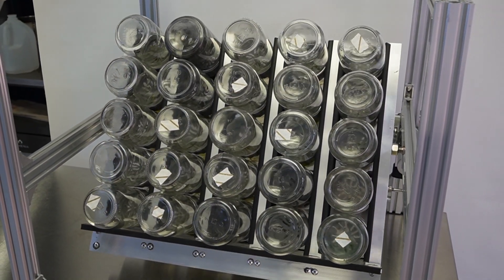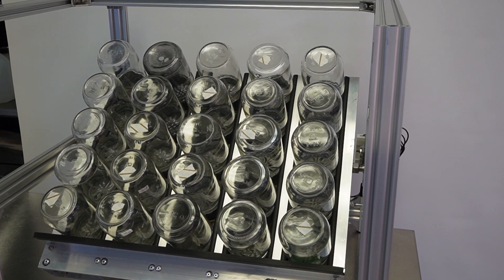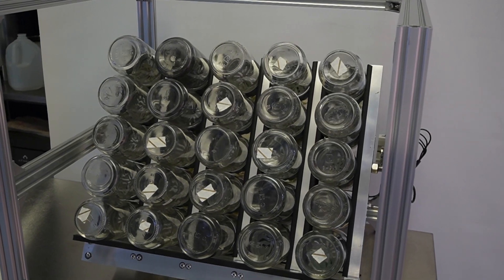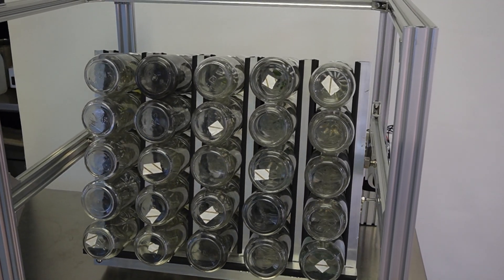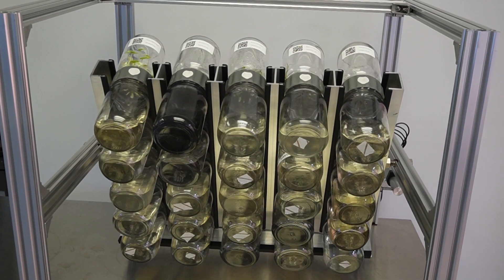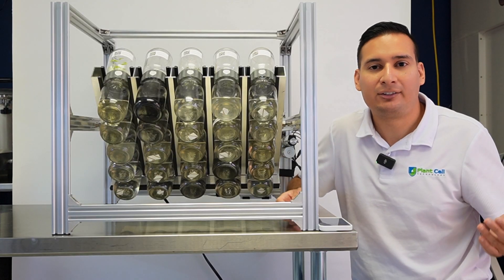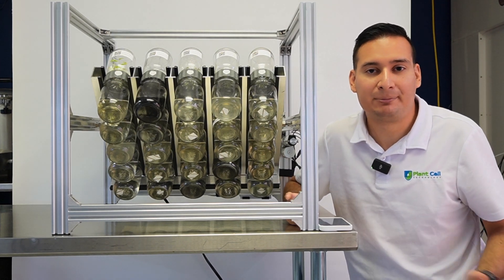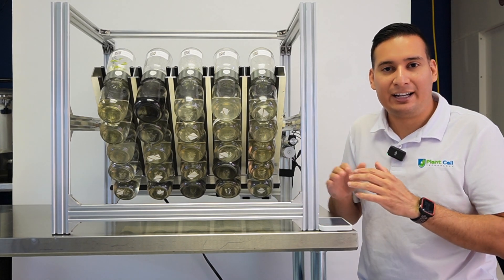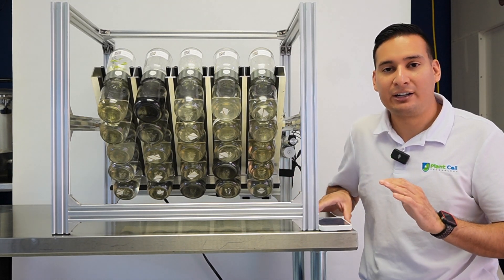When I say this is a fully automated system, I mean it — because you can program it the same way as you can program a smart light switch, where you set it to turn on at one time and off at another. You can configure your BioTill to flip, say, every six hours for one minute. You set it once in the app and you're done.